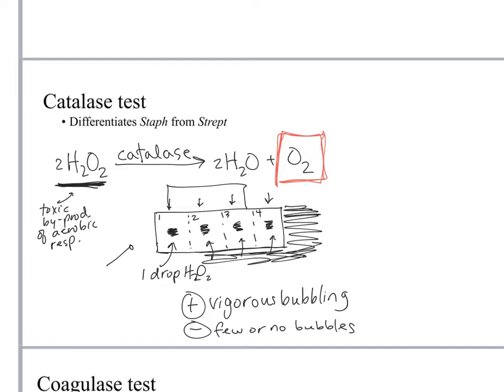That does tend to go off, and we haven't had problems with that for a long time, but that's why the hydrogen peroxide is in those brown glass bottles, because eventually the light basically disassociates it into water. Okay, so if the hydrogen peroxide is not good, then this isn't going to work, and just convince yourself that that works.